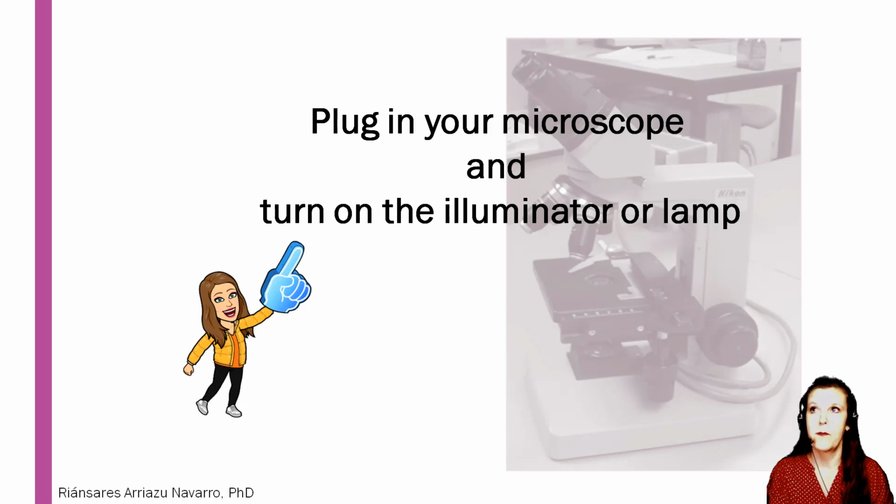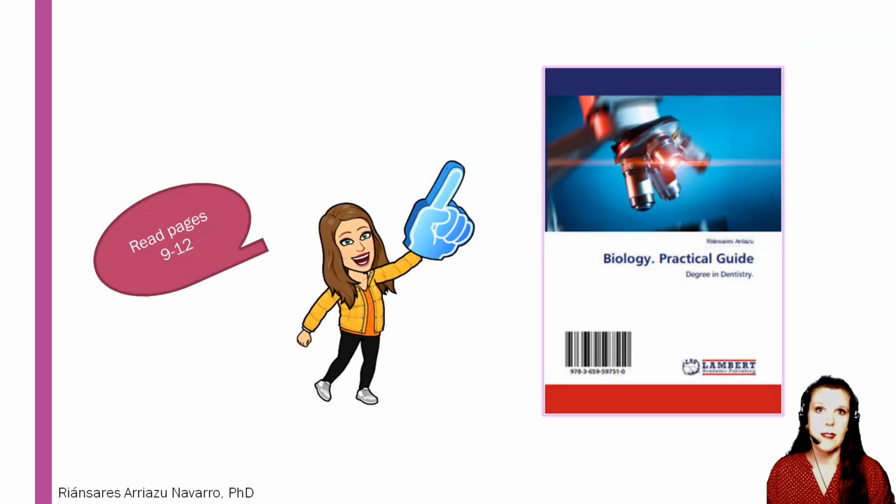Well, this is the anatomy, but don't forget to plug in your microscope and turn on the illuminator lamp if you want to work with it. You can see extra information in your lab book. You can read pages 9 to 12, okay? That's important.